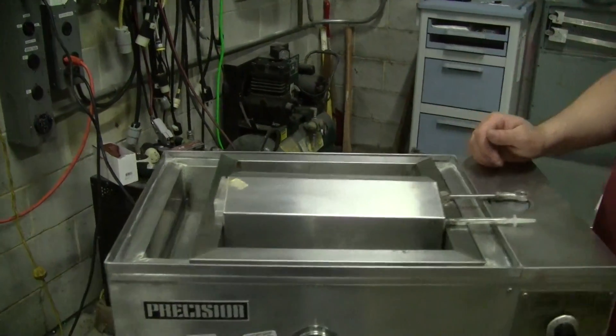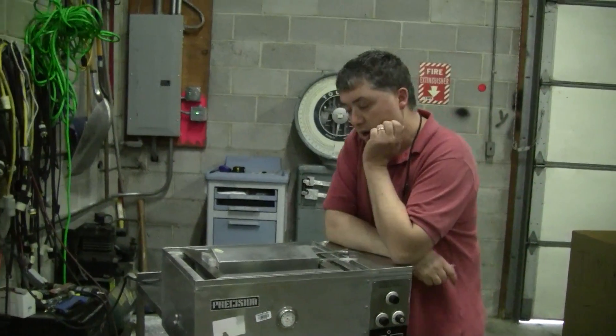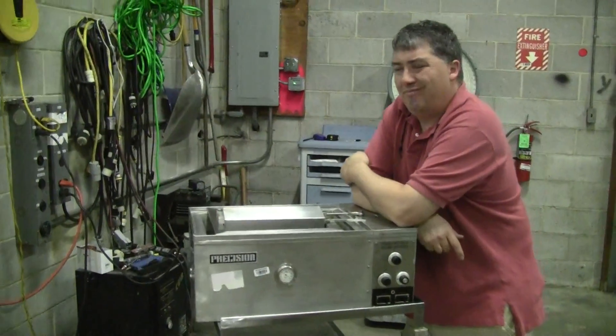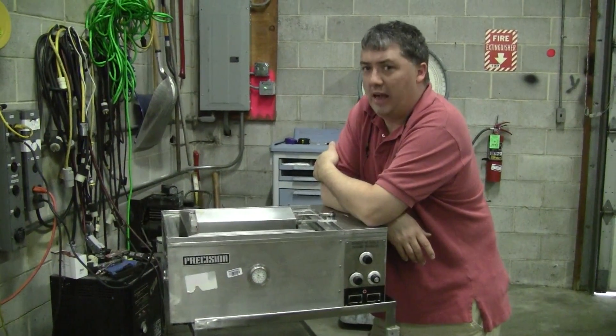These units typically run on 115 volts and are typically stainless steel, which cleans up very nicely. I happen to like the non-membrane pad — non-electronic, more mechanical. It's easier to fix and long-lasting.